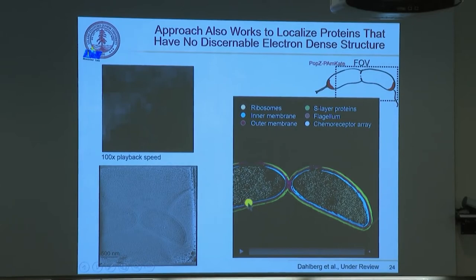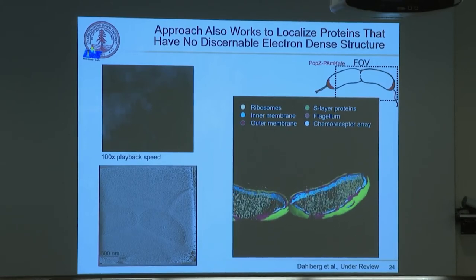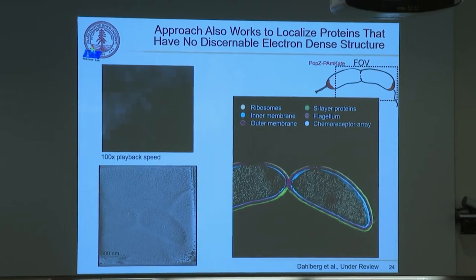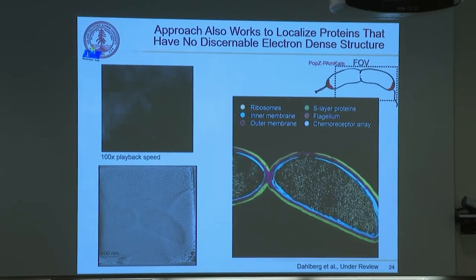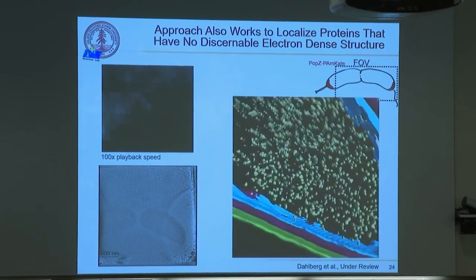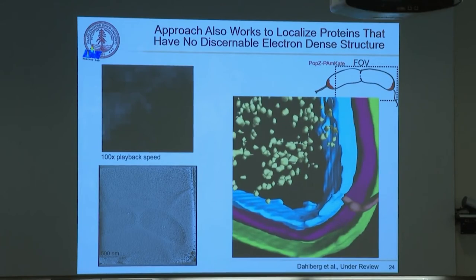And you see all these dots. These dots are all coming from ribosomes. Ribosomes are large and big black blobs, so you know which things to mark as ribosomes. But remember, this is hand-annotated, and some people use neural nets to do that too, but they train the neural nets by having people pick out these spots. And that's fine, so it gives you a fancy-dancy image that you can rotate and so on. But what about all the proteins that are not annotated? That's the point here. There's thousands of proteins that are not annotated, and that's why we're looking at these optical experiments to try to annotate those that are not easily seen.